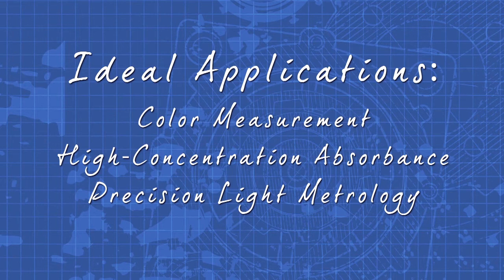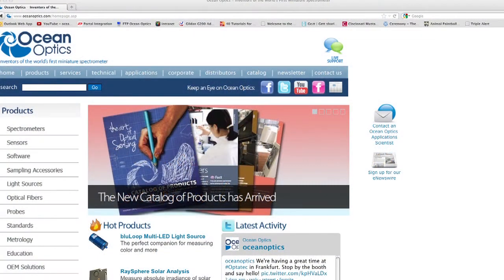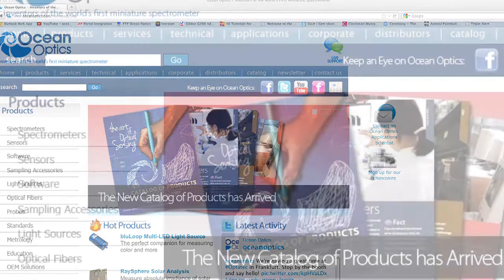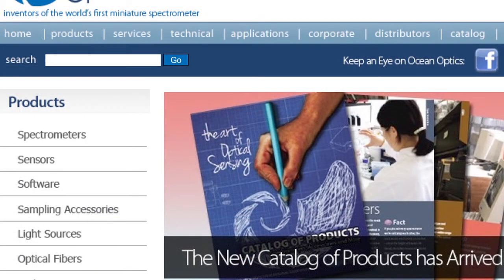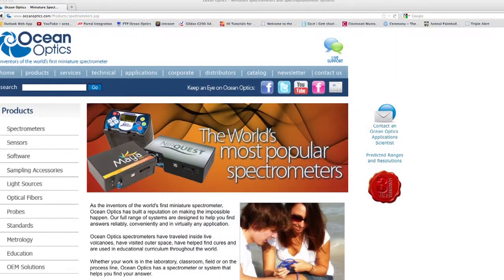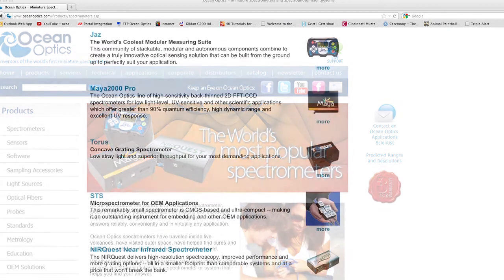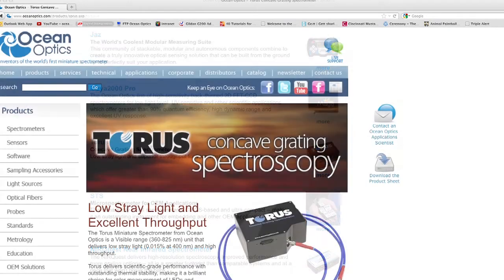and precision light metrology. Visit OceanOptics.com and click the spectrometers tab on the left hand side to get more information on Torus and other miniature spectrometers from Ocean Optics.